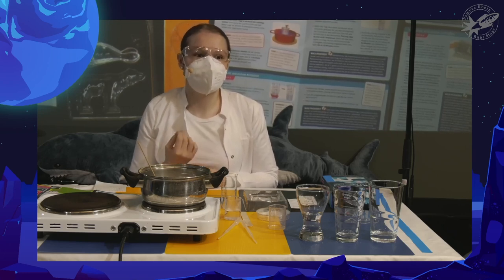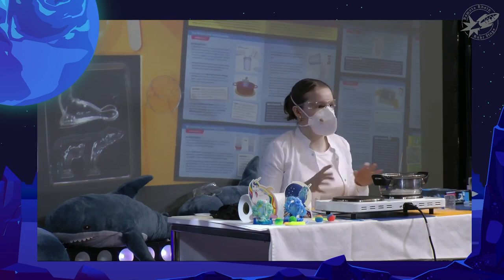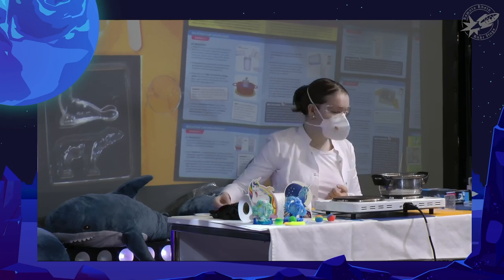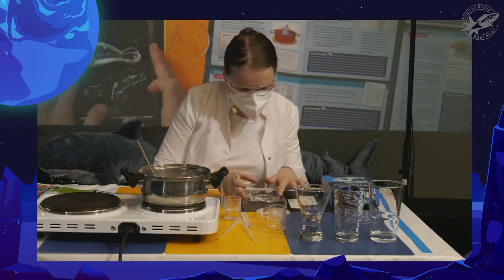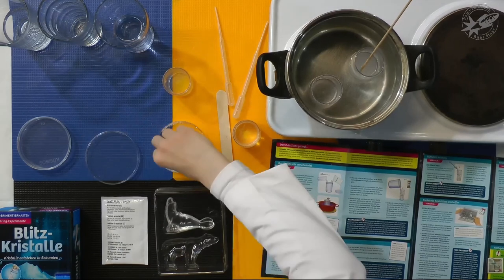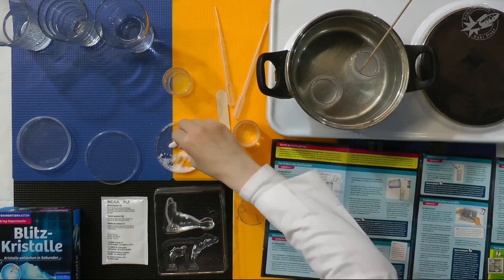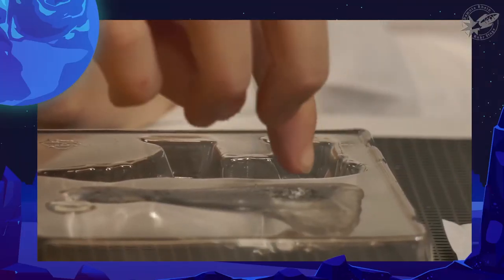It is used in cosmetics as well to cover bad breath. Quasi den Grundgeruch überdecken, dann riecht es ein bisschen nach Essig und dann tut man noch ein bisschen Parfüm rein. If you add natrium acetate to cosmetics, so viel zu dem fachlichen Teil, you're going to be able to cover certain smells. Wir probieren das einfach mal, ob das funktioniert mit dem Starterkristall. I hope this cooled down a little bit. We're just going to try if it works with the starter crystal.